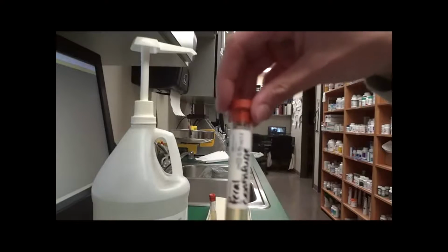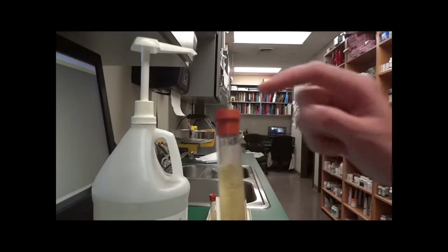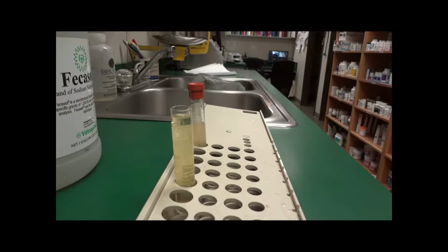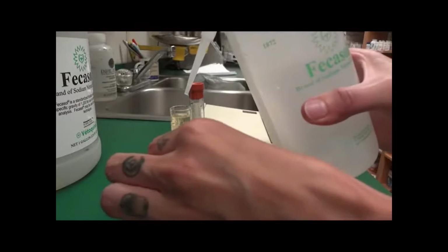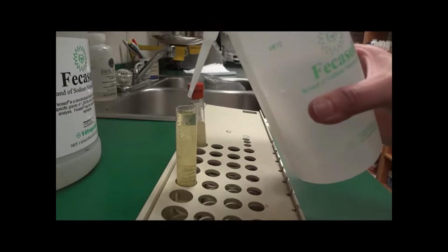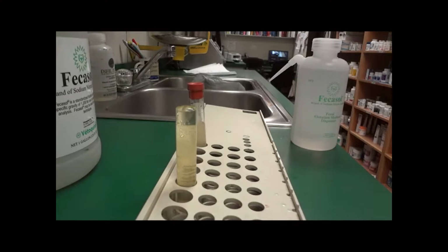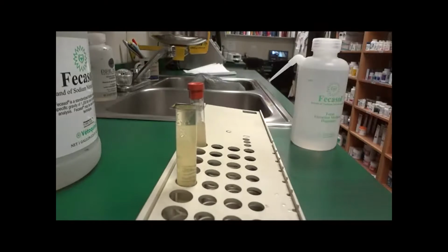Alright, our fecal centrifuge has finished its 5 minutes. We're going to fill the rest of the way up with our Fecasol and apply a cover slip to the meniscus. We fill the rest of the way up the tube so that we develop a meniscus. We will then apply a cover slip to the top of it. We'll allow this to sit for 10 to 15 minutes undisturbed, and then we'll place the cover slip onto a microscope slide and examine it under the microscope.